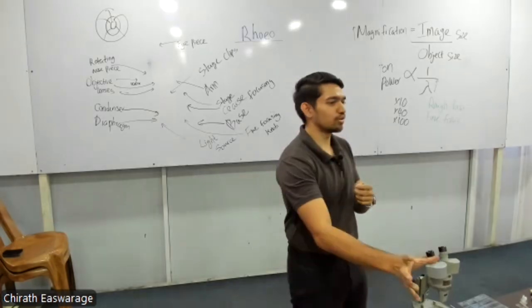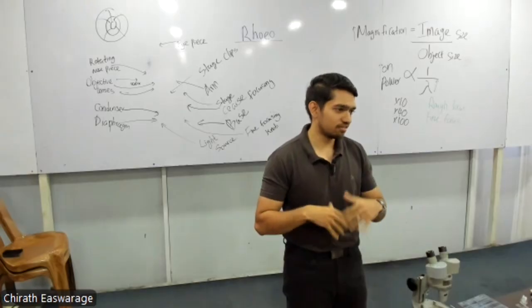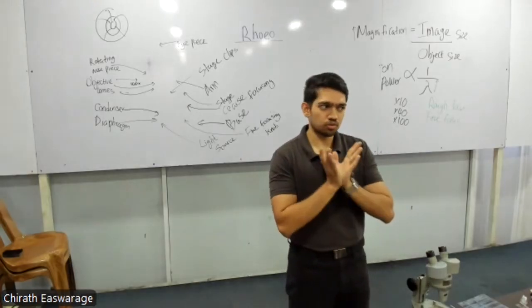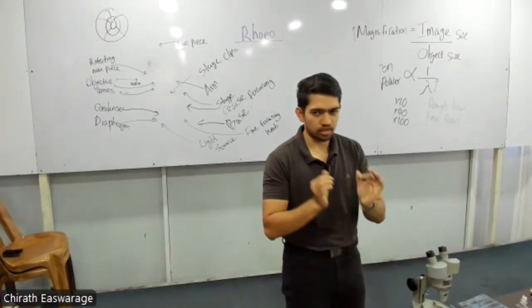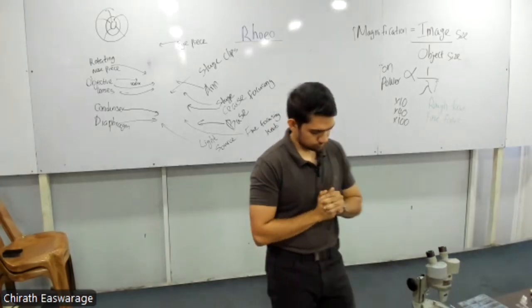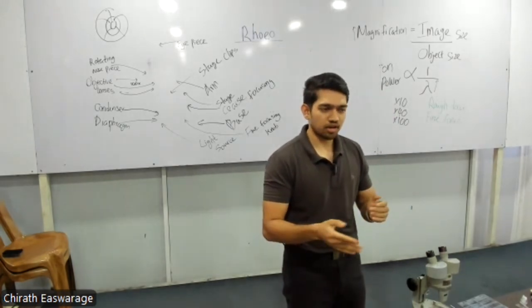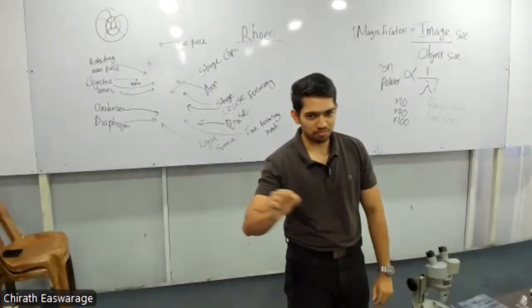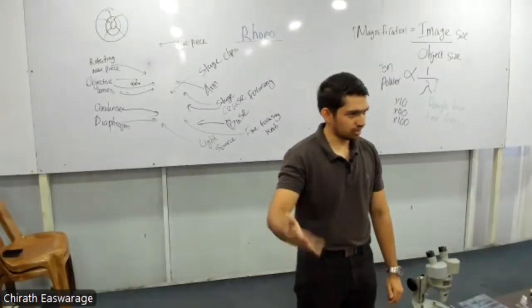Secondly, when the electrons are going through them, their cellular structures are going to get damaged, and anyway, those cells are going to die. So nothing can survive electron microscopy. So you can only observe what? Dead specimens, right? The cells have died. Okay. So what do you mean by non-living here? Like we are not taking dead parts, but because when we are preparing it to be observed, it will be killed, right?